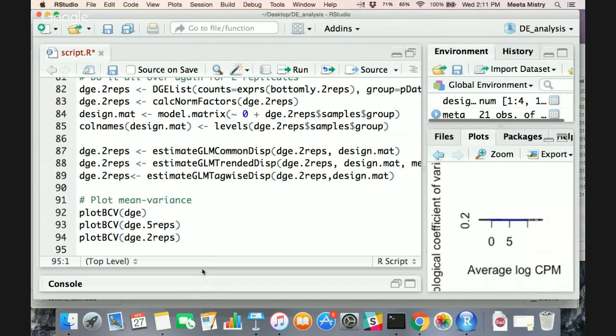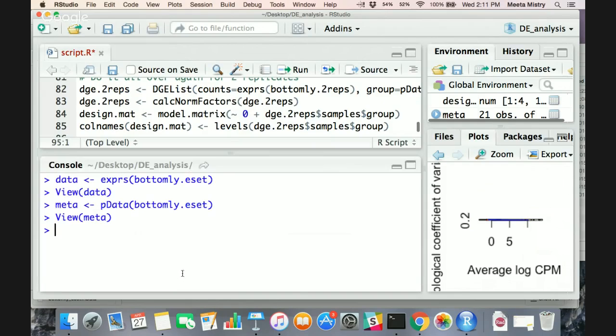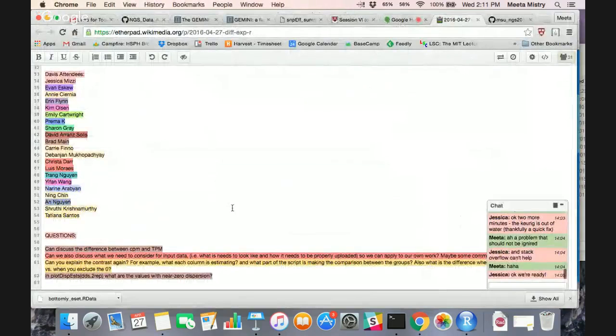Okay, so that's the important thing also to remember, is that when you have the two data sets, make sure, a quick sanity, actually not a sanity check, you should do this before you start any kind of analyses. Make sure that the order of your samples as they are listed in your data matrix are identical to the order as they are listed in your metadata table, because otherwise that will cause you problems later down the road.